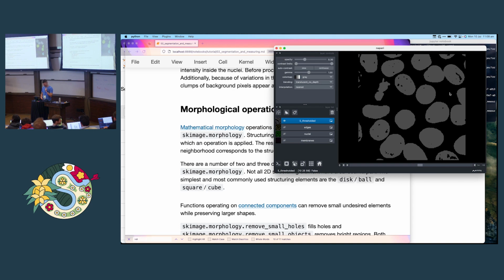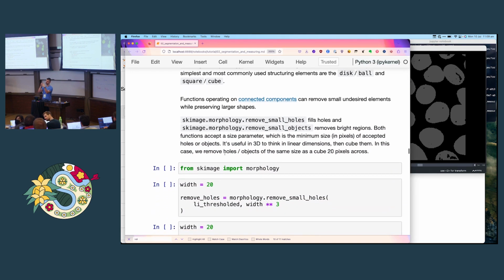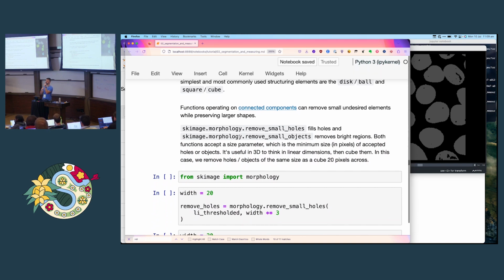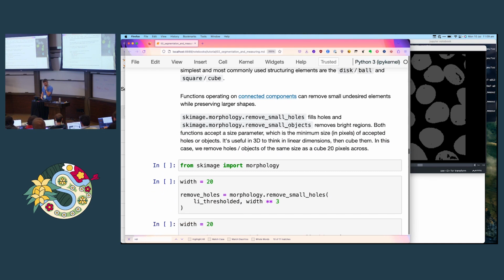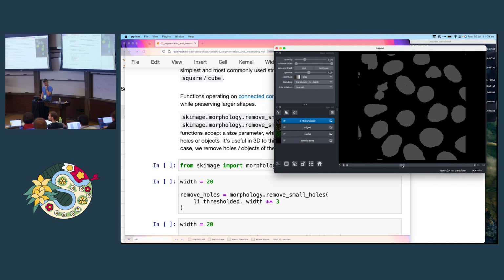Okay, how do we find the markers? Step back. So a very common thing, which is what we did with the two circular blobs, is to have a binary image, and then do a distance transform, which tells you the distance from the edge of the binary image, and that should give you a single point in the middle. But we're going to see that that worked really well for the two perfect circles that we had made before. It doesn't work so well when the edge is a little bit rough here.